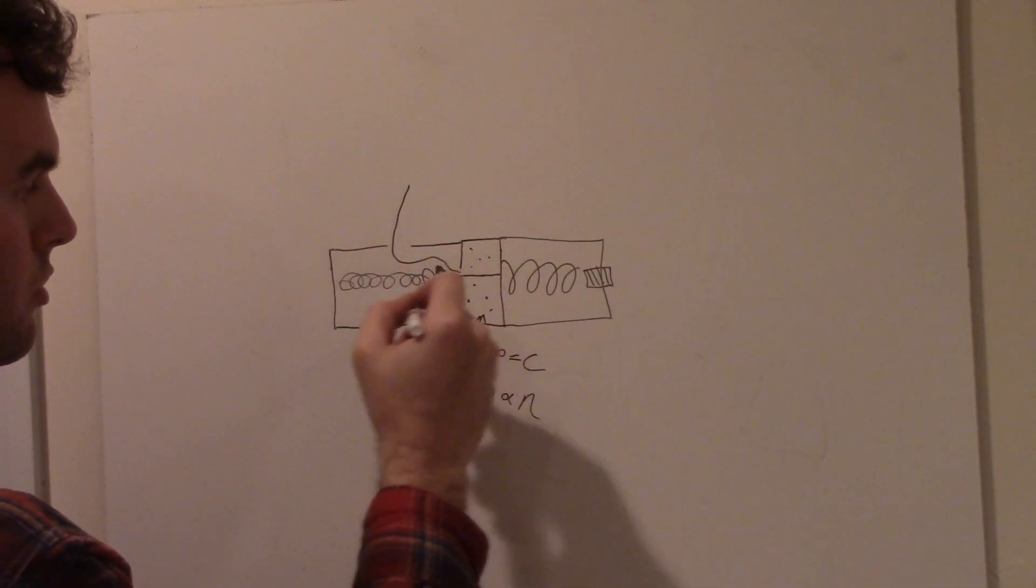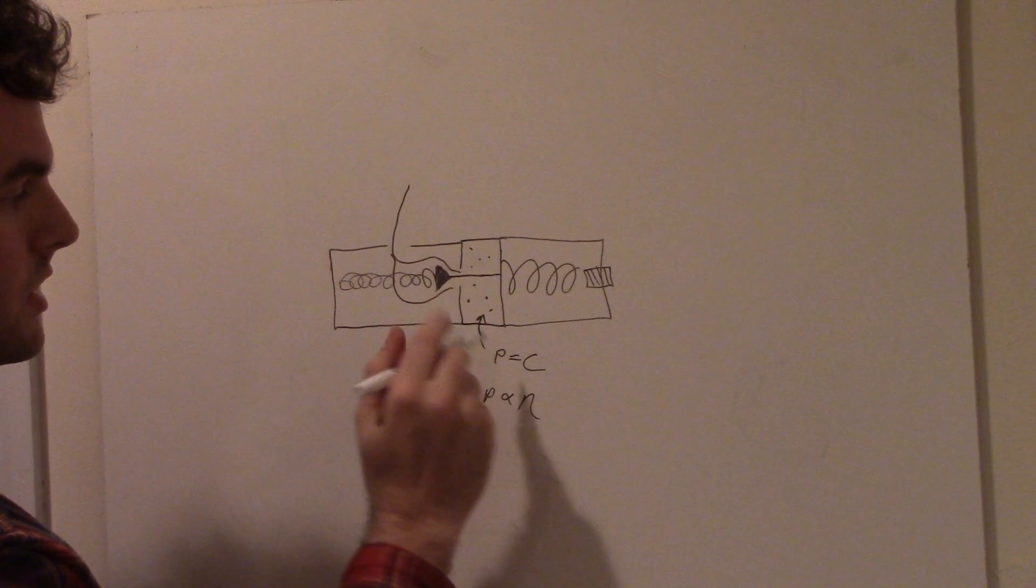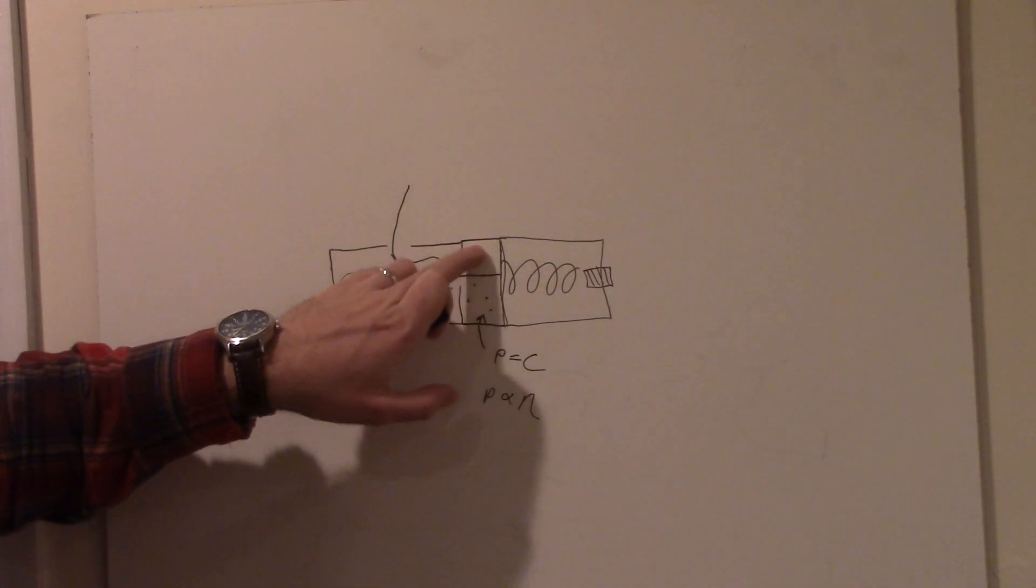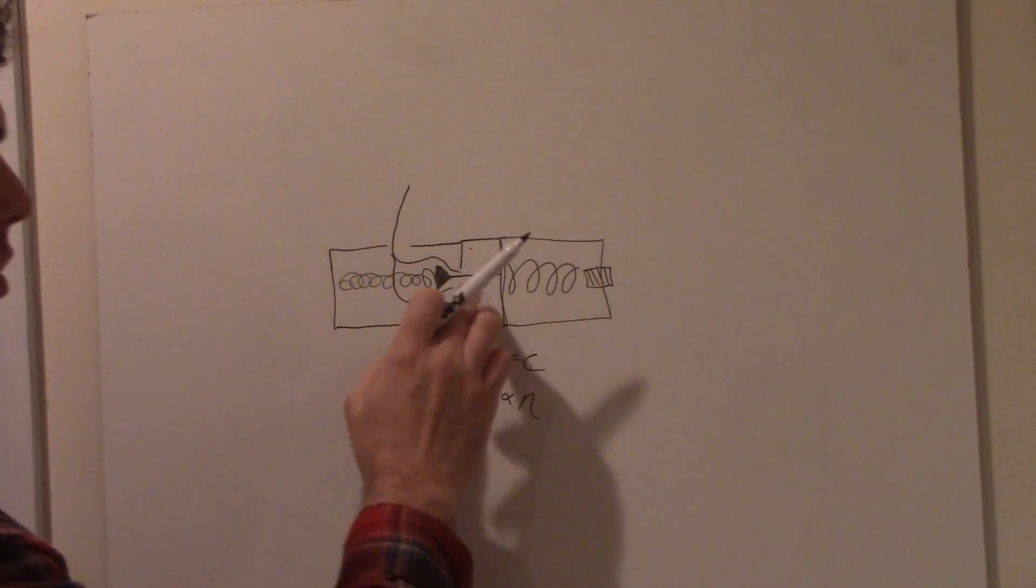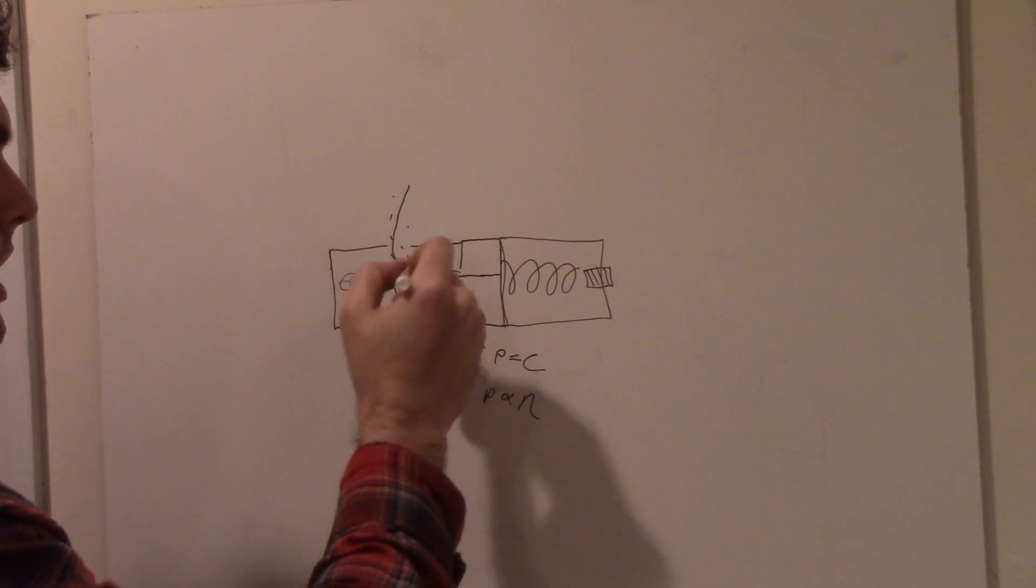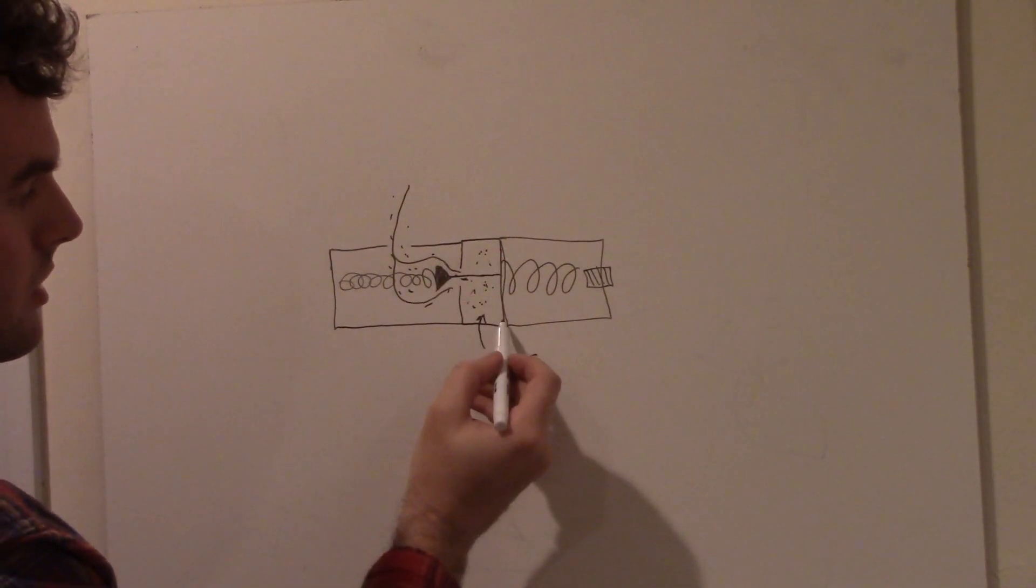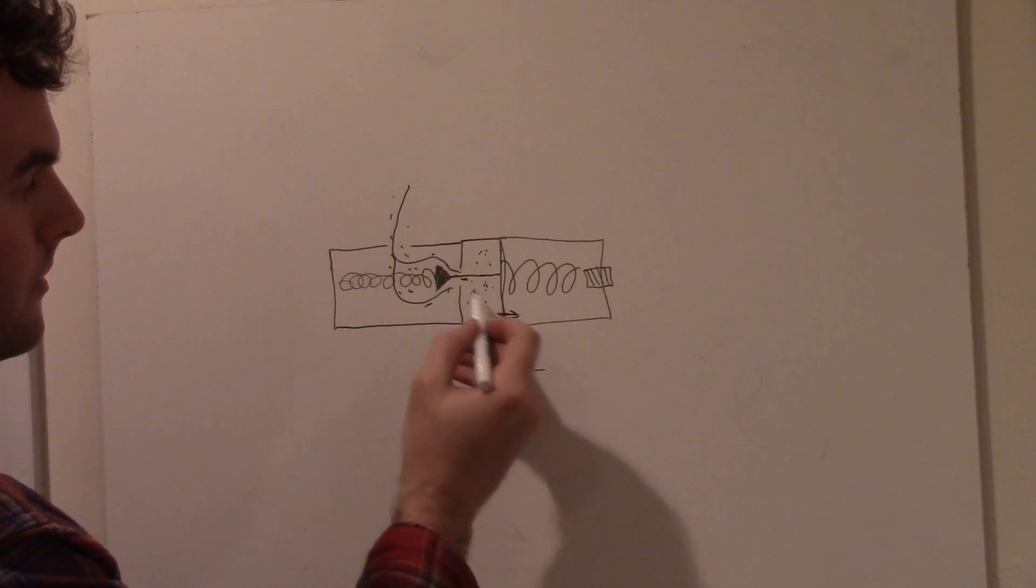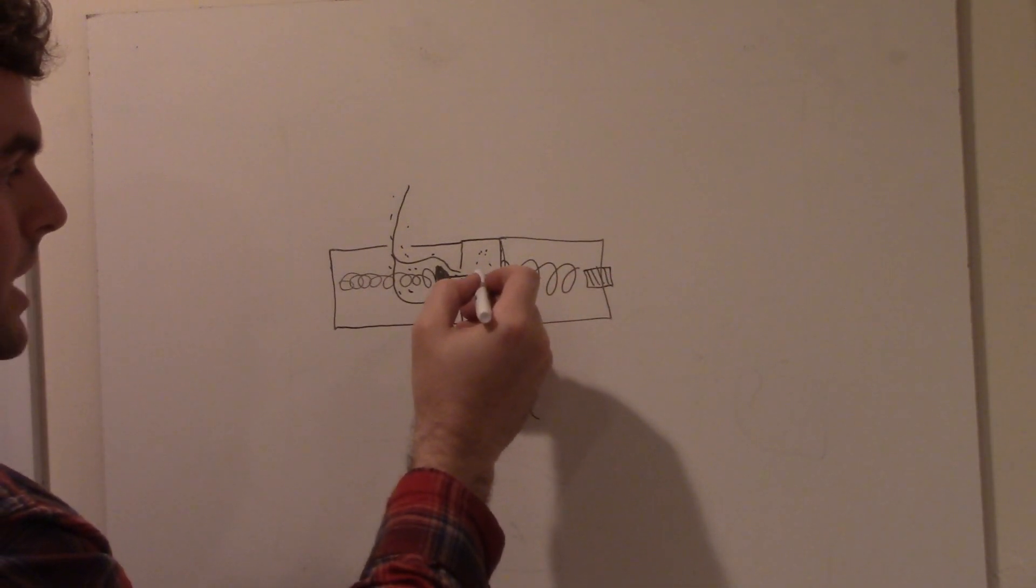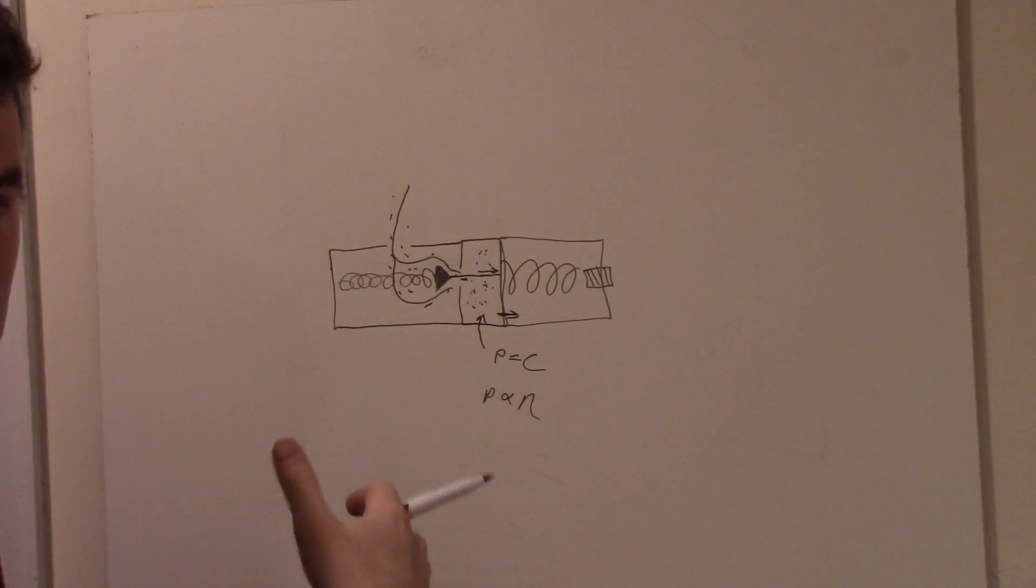The way that that is accomplished is there is a spring which is trying to push this valve closed. So this spring on its own would push this valve, closing up this hole and preventing any more gas from flowing through here. But there is a stronger spring which is pushing on this diaphragm here that's trying to keep the valve open. Without any pressure in here, with no gas molecules or only a few molecules, this valve is open.